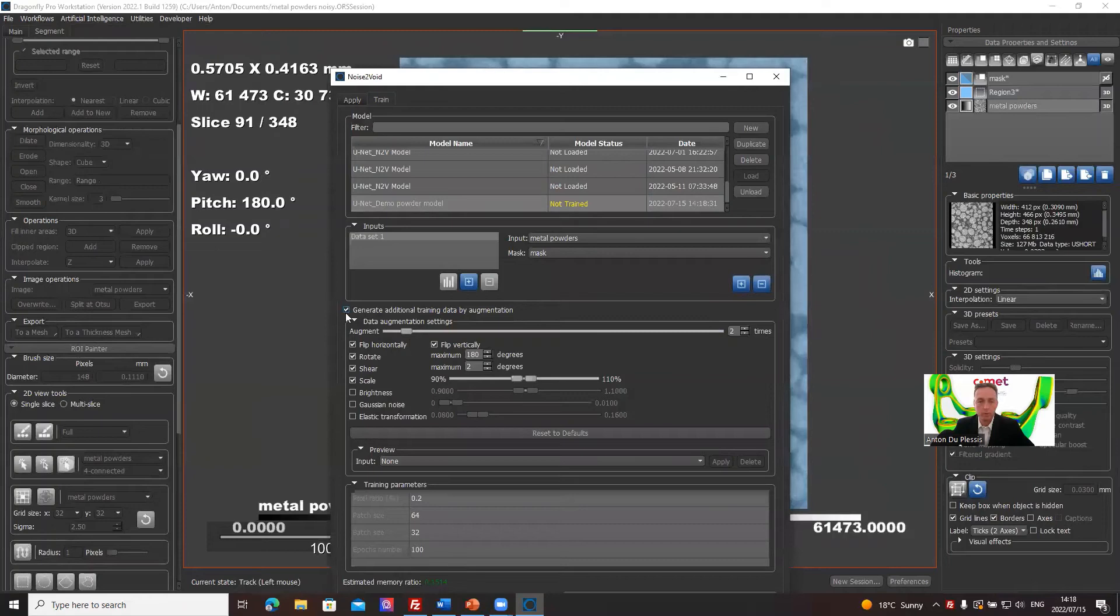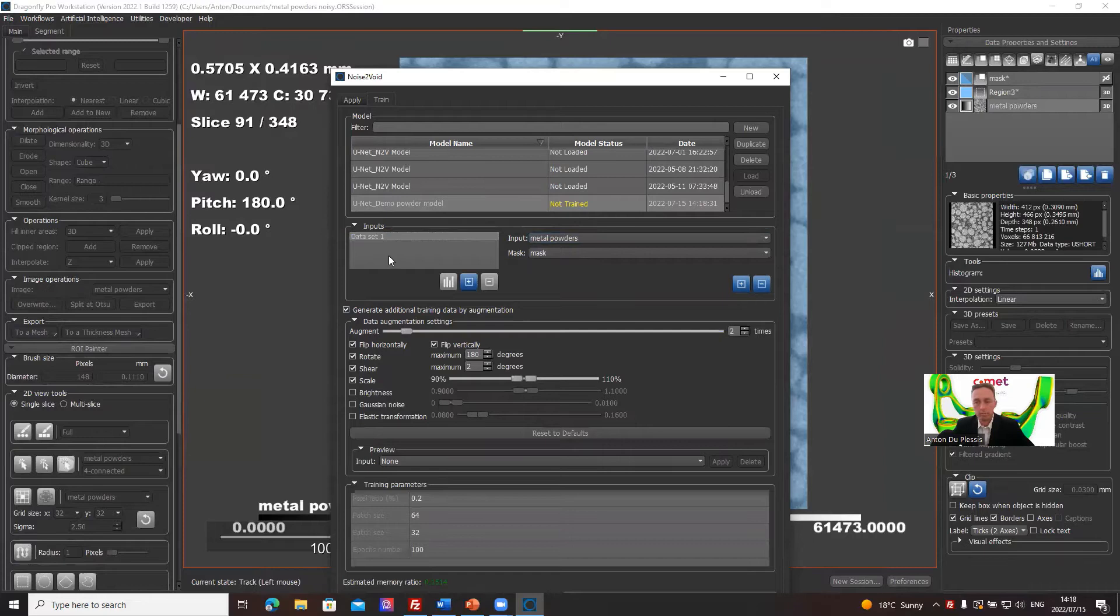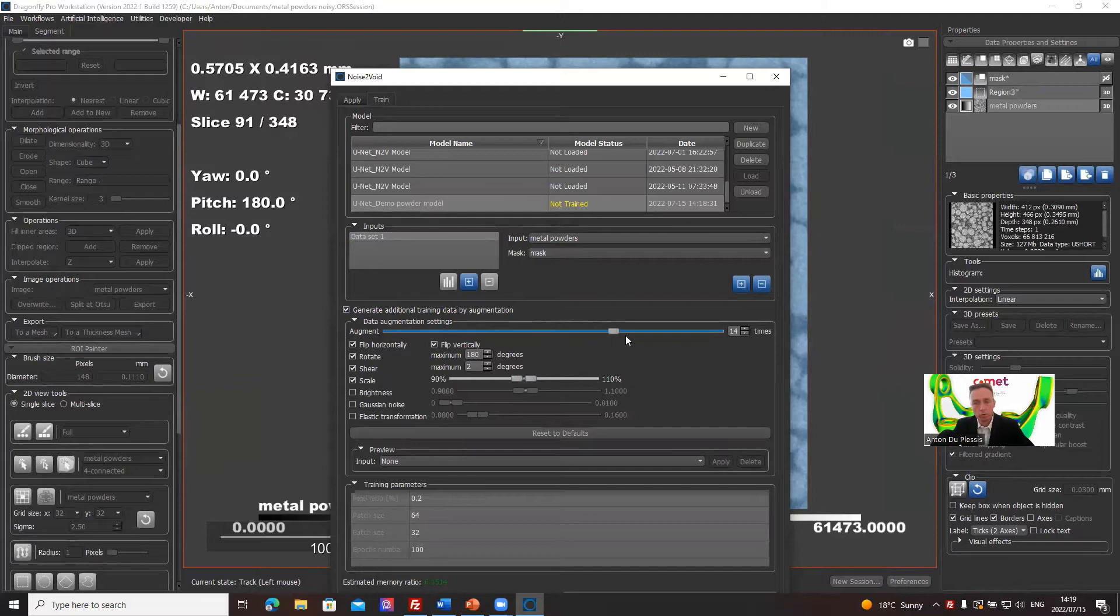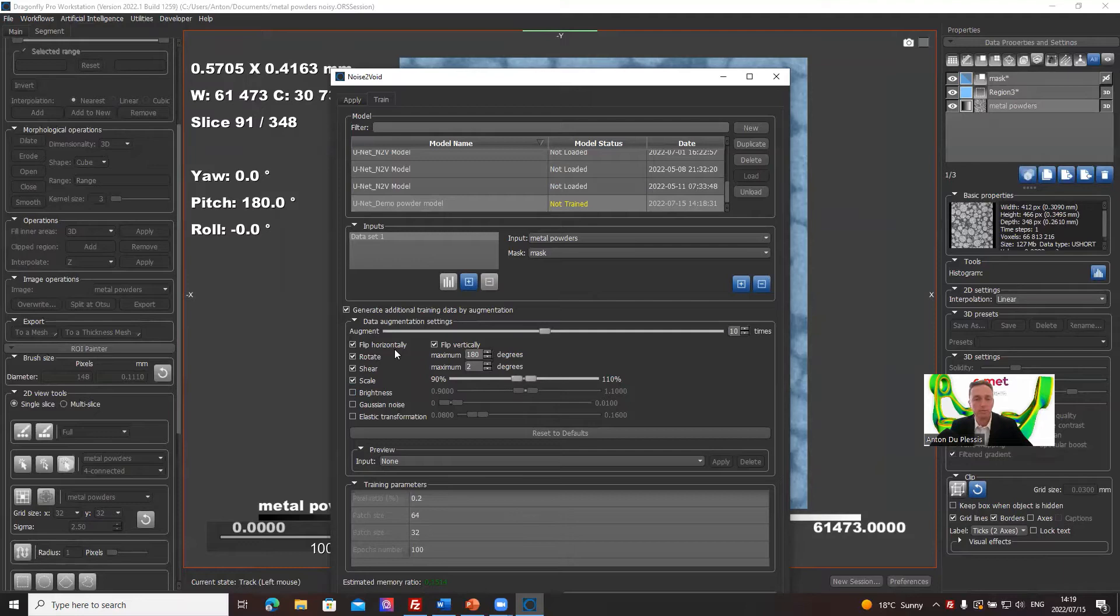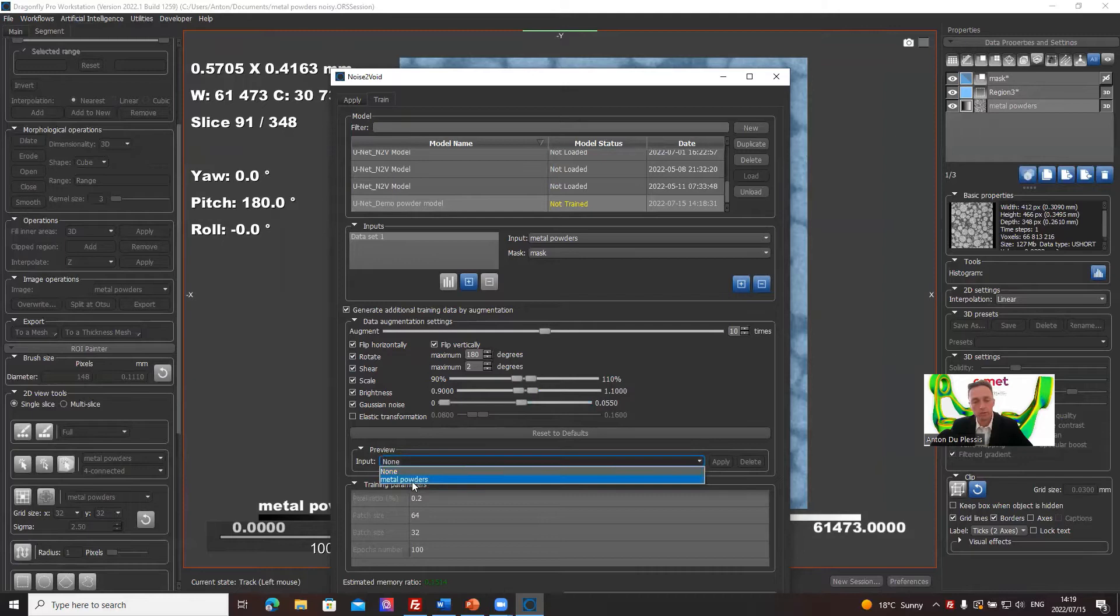Now, very important here, you can use different inputs actually. You can use different data sets as input for training. If you want to generate a robust model for different scans, for example, generate additional training data by augmentation. Here we can increase the augmentation. The more you do it, the longer it takes, but the better the result is. We're going to take something in between there. It's basically creating more data by flipping your data and sharing it and scaling it and making it brighter and increasing, adding more noise to it and so on.